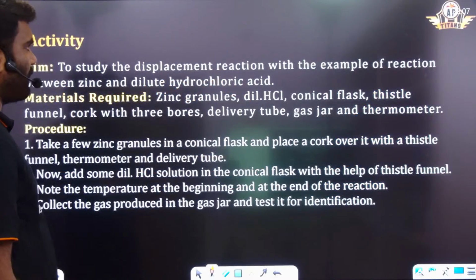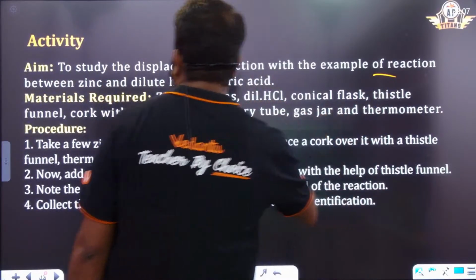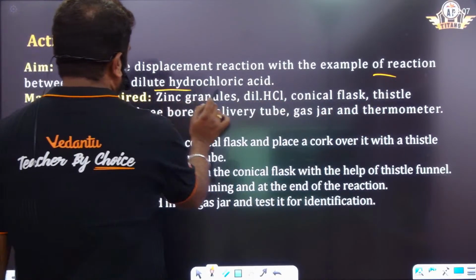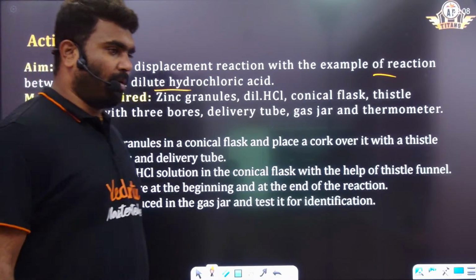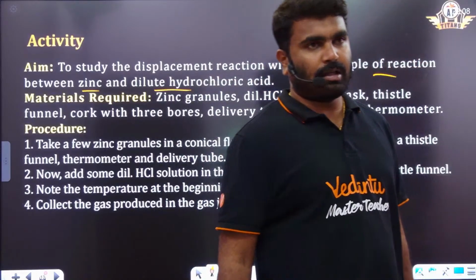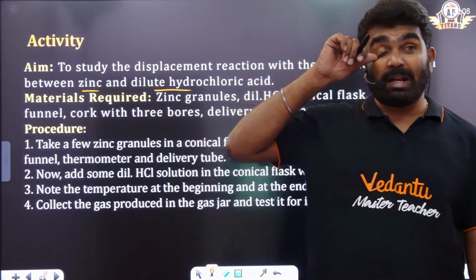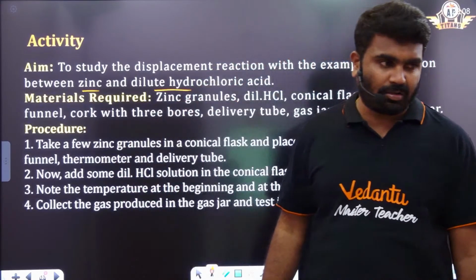Okay, so next, to study the displacement reaction with the example of the reaction between zinc and dilute hydrochloric acid. We have to do the reaction with dilute hydrochloric acid, okay? So only 3 left: displacement reaction, next double displacement reaction.